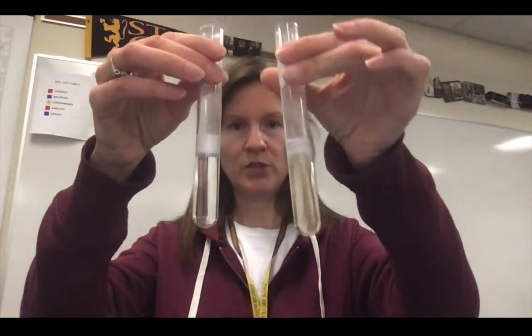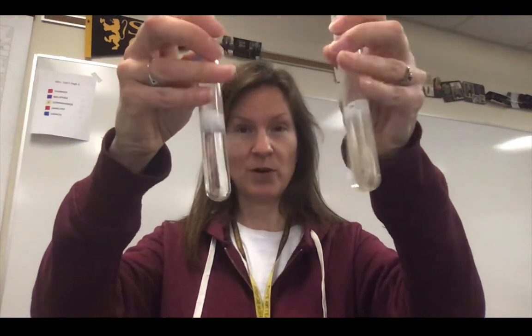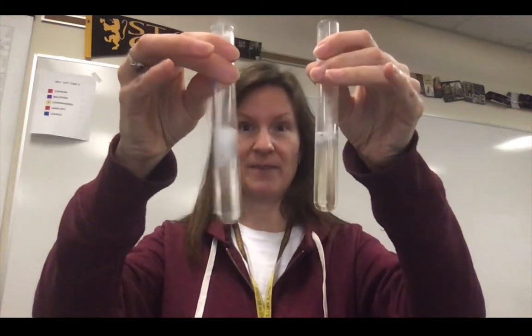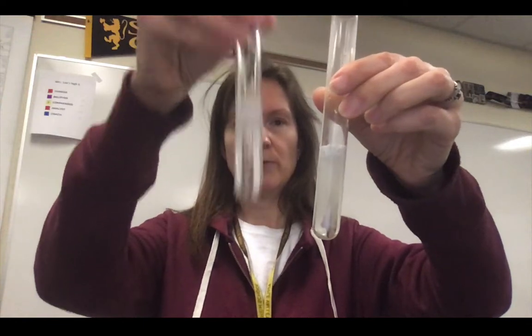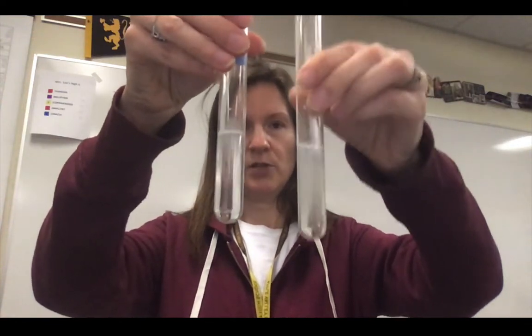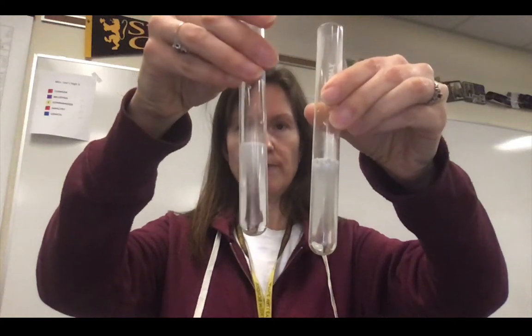So now test tube number 2 is on this side, very similar to test tube number 1 in terms of the reaction we're seeing. So you can record observations. It's really hot, by the way. So the reaction's almost over. Test tube number 1 on this side, number 2 on this side, just so you get a sense of what it's looking like when it's almost finished.